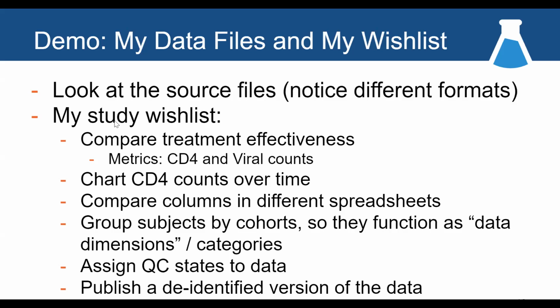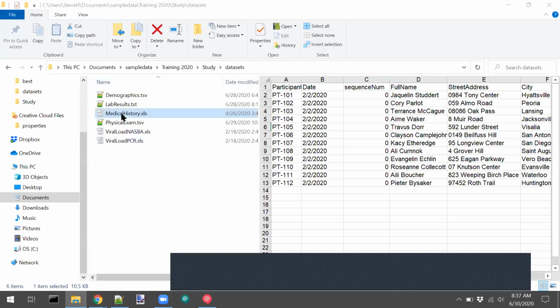There's also a medical history. And, oh, I got paused somehow. Can you hear me, Jason? Yes, we can. That's fine. Can you see me moving around here? No. Okay, it says my screen sharing is paused. I think somebody might have pressed share by mistake. I'm going to steal it back. Okay, I'm back.